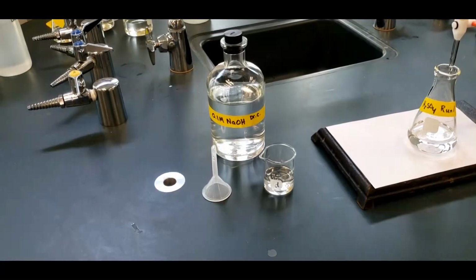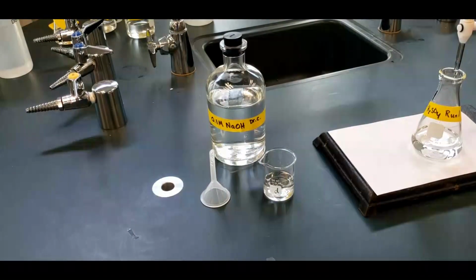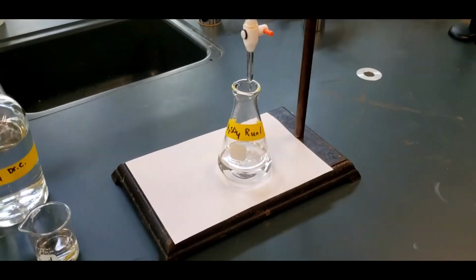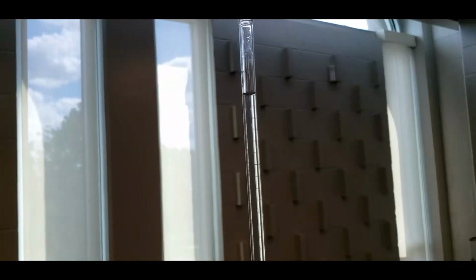I use the funnel and the small beaker to fill the burette with sodium hydroxide solution. That's the only thing that will ever go in the burette for the experiment. Here's the sulfuric acid run 1 ready to go. And then here's the burette filled up to the 0 mark. And we're all set to go.